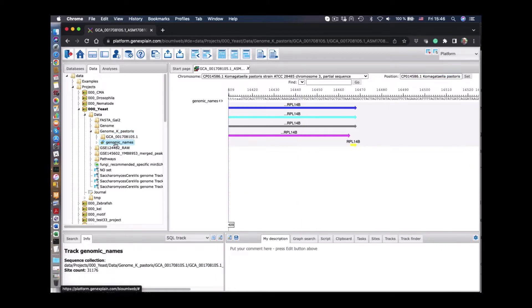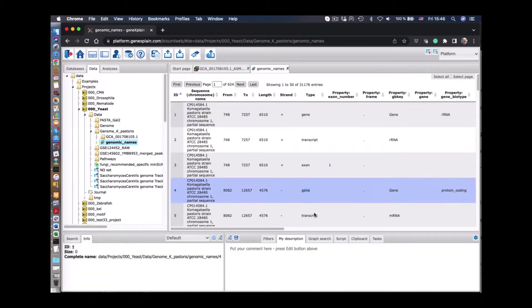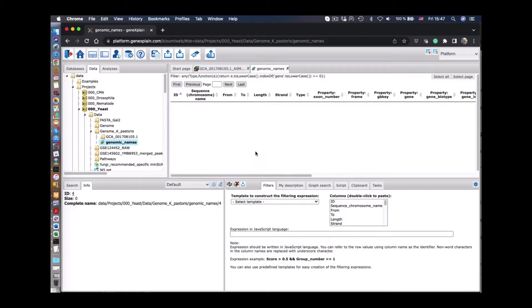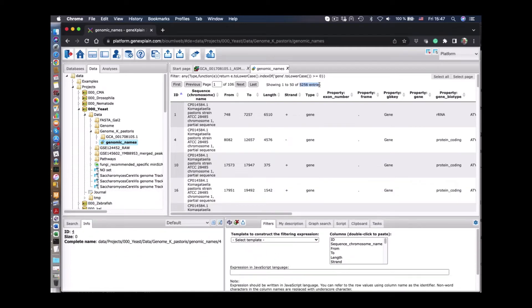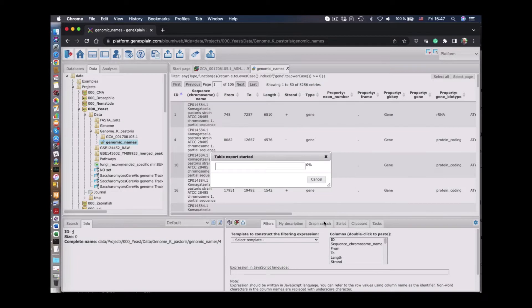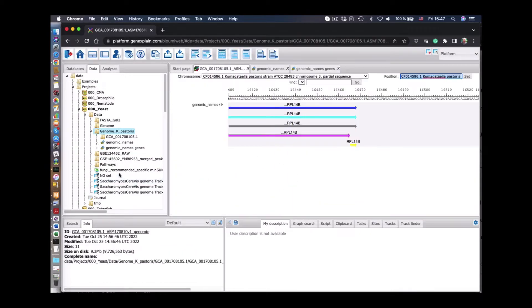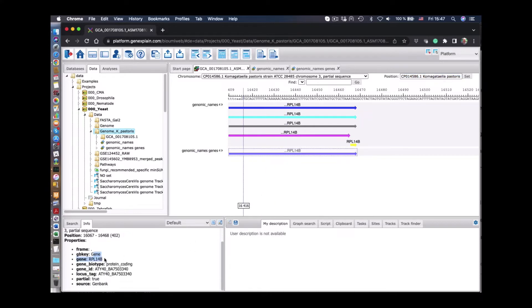We can click on a particular feature or open all annotations in the table. We can see that some of the annotations are for the full gene and we want to select those annotations only. We filter this table by the property 'gene' in the column, and now we see 5,000 genes are selected. We can save them as a separate annotation file and also visualize this file in the genome browser. Now we see that file contains the annotations for the genes only.